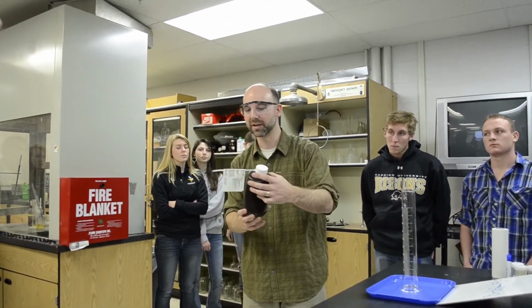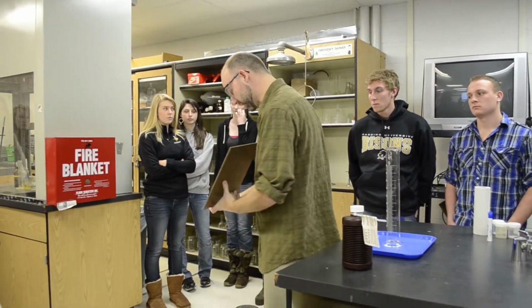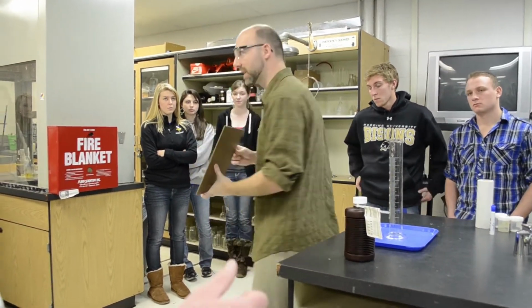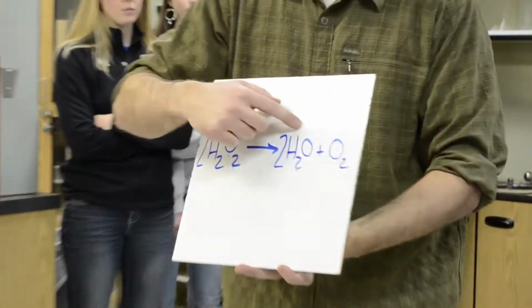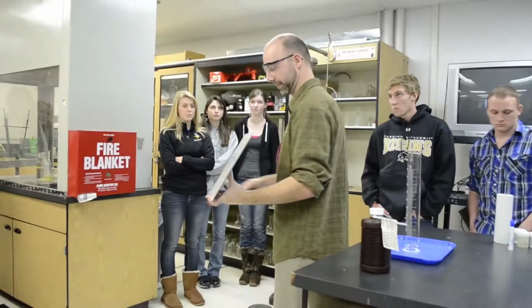Now this is not your run-of-the-mill hydrogen peroxide. It's not the cheap stuff that you buy in the store. It's more concentrated. I'll explain that later. Here's what's happening with hydrogen peroxide, H2O2. It breaks up, it decomposes into two things, water and oxygen. That's the reaction rate that we want to observe.